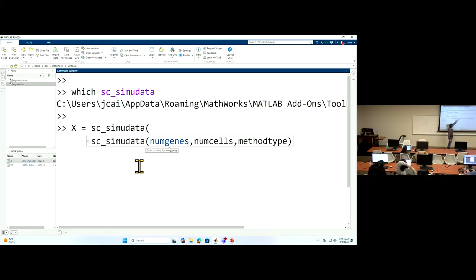The first one is the number of genes you simulate. In our simple example, you had 3 and could not change it, but now you can change this number. Then the number of cells: we tried 5,000, 1,000, 50, 1, it doesn't matter. You need these 2 parameters. The method type doesn't matter. So we need 2 integer numbers.